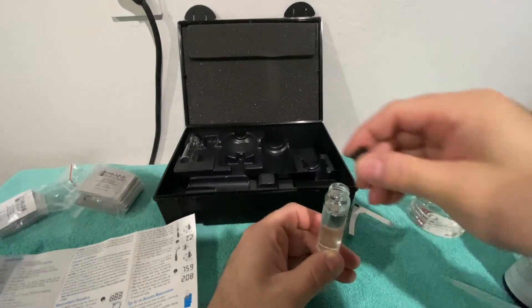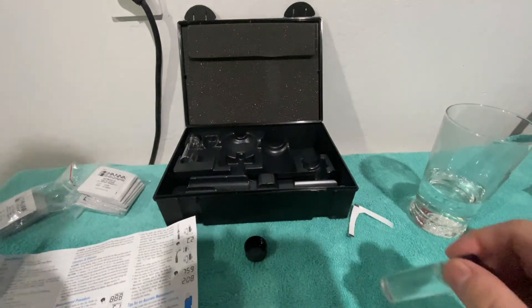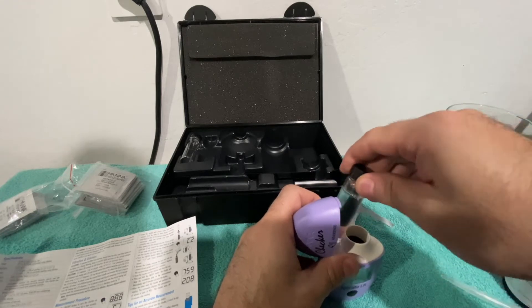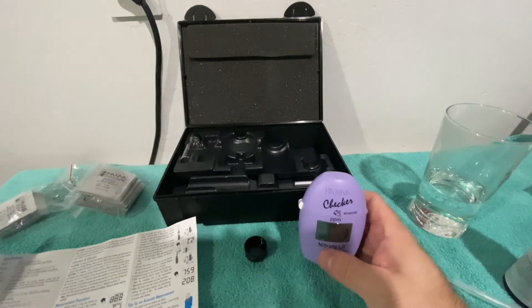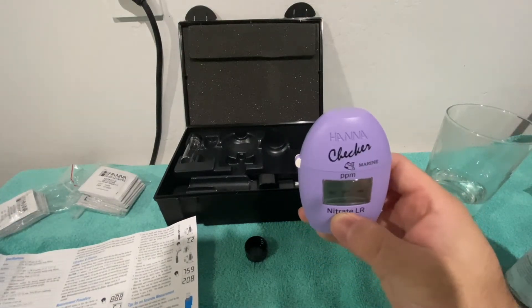We have 10 milliliters pushed into the cuvette. Now it says to put the cuvette in and hit the button, and it should switch to C2 mode.